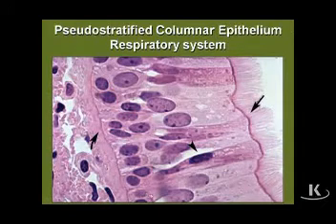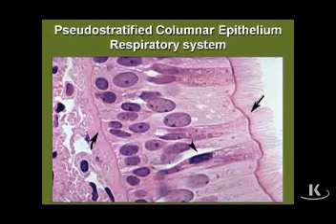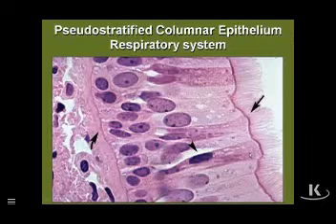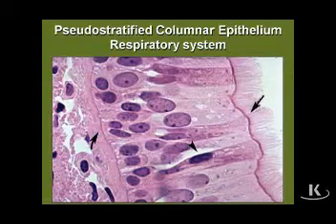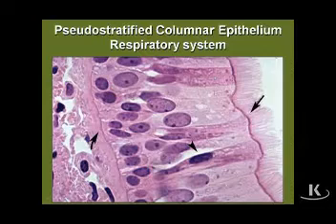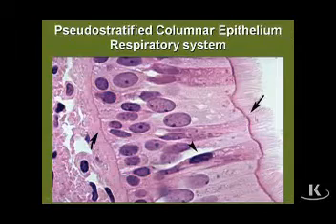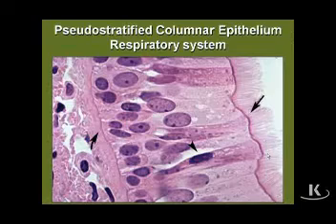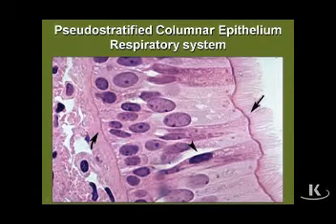The two cell types that do reach the luminal surface are goblet cells and ciliated columnar epithelial cells. The lightly stained areas are the columnar epithelial cells, and adjacent to them are examples of goblet cells or mucus-secreting cells. The cell surface specializations dominating this epithelium are true cilia, which are much taller than the brush border formed by microvilli in the simple columnar epithelium of the small intestine.